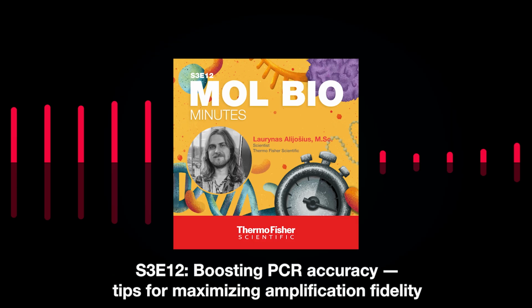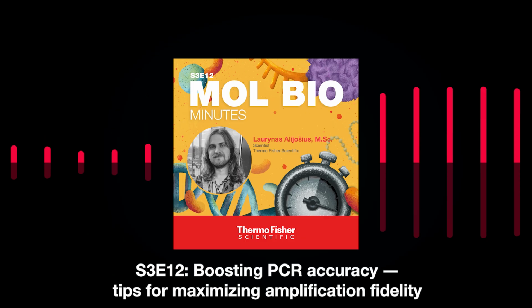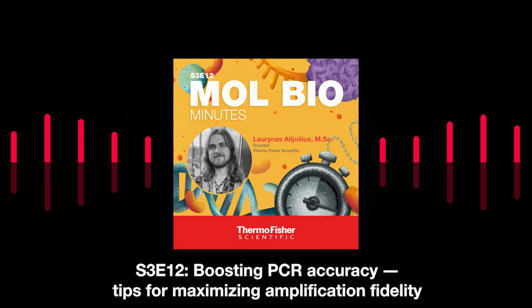On the other hand, if you use an accurate, high fidelity, advanced polymerase, then you can produce PCR products up to 20 kilobases in length or even longer products. This is very helpful if you work with large genes or if you would like to prepare some long read sequencing libraries. That could help you a lot.